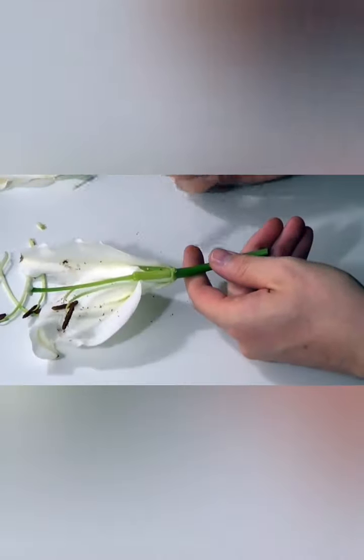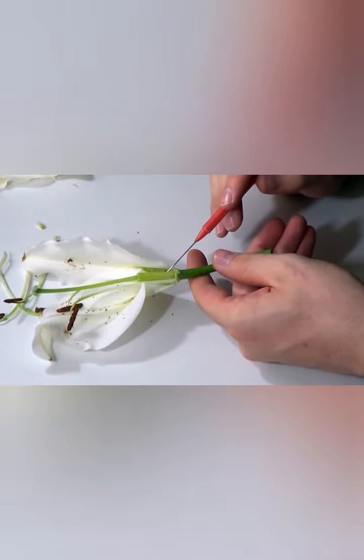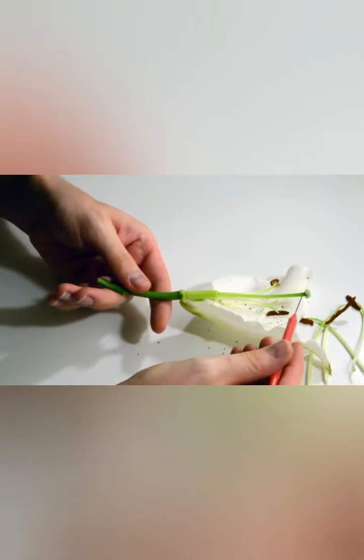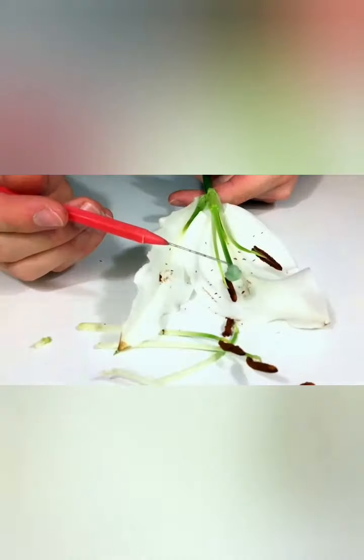Next, let's have a look at the female reproductive part of the flower. At the bottom here is the ovary. This is the slightly large inflated part which will go on to develop into the fruit. Above that is the style, and at the top of the style here is the stigma, and this is where the pollen must land.